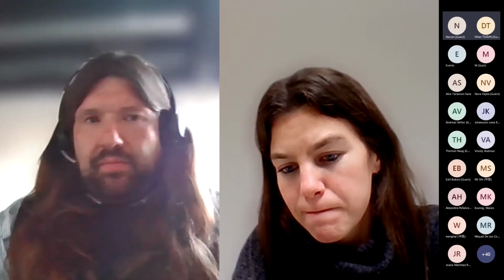You can measure iodine-129 without disturbing a sample. If you got 1 kilogram of soil, you just put it on the detector and measure iodine-129 by measuring its gamma energy at 39 keV. So my question is why do you bother going through all the radiochemical separation to measure iodine-129, where you can easily measure it, like cesium-137? That was my question. Yeah, thank you very much for your question.